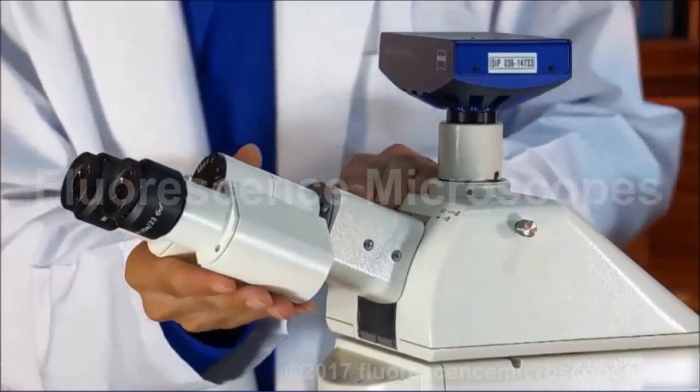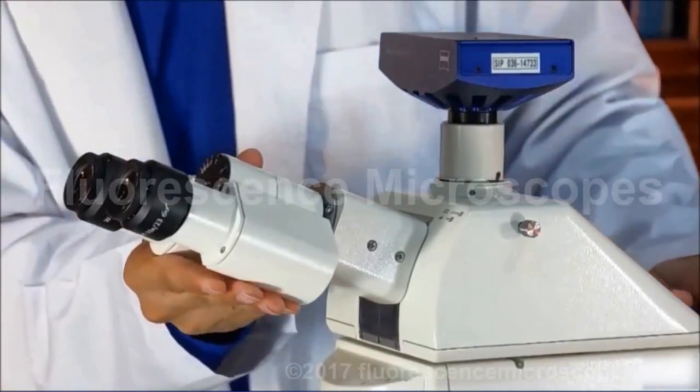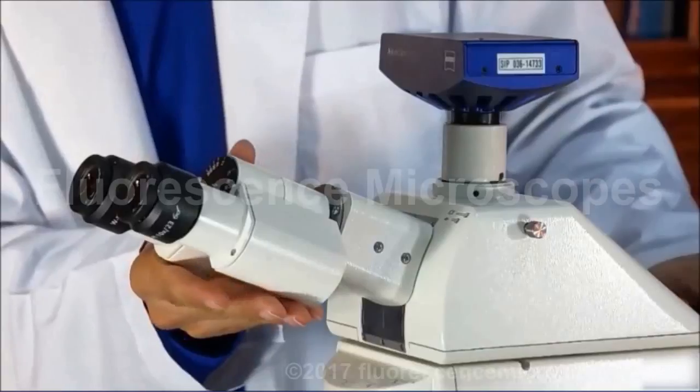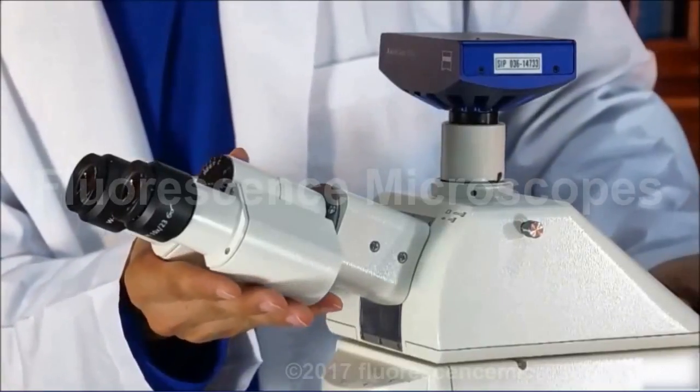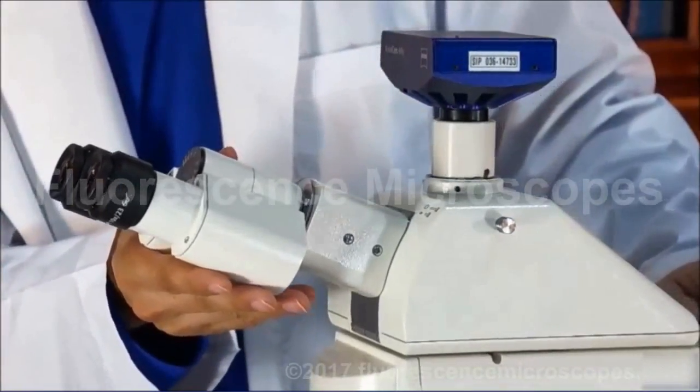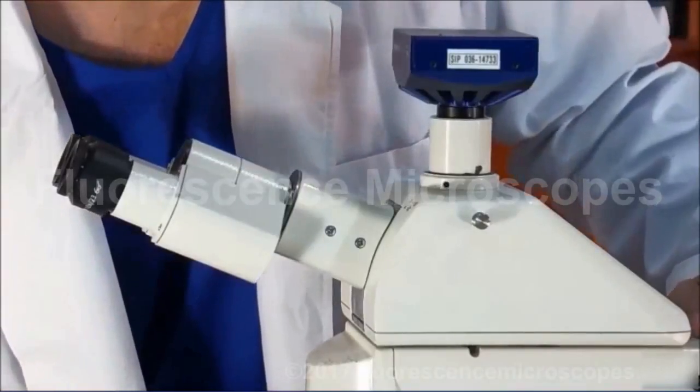It may seem like a simple thing, but when you're sitting at a microscope for many hours in a day, it's very helpful to get the right ergonomics. Helps a lot with the back and neck strain.